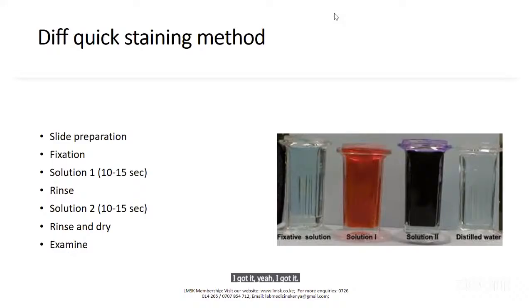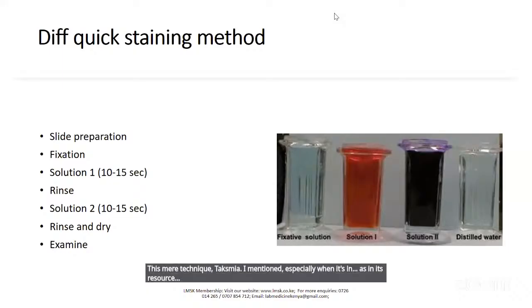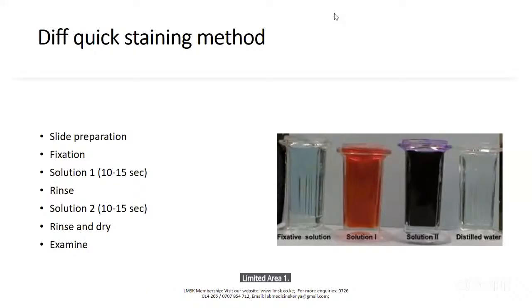The touch, that's the smear technique, touch smear. I mentioned, especially when it's a resource limited area, whereby you don't have the cryostat. For the touch, mostly it's results on site.